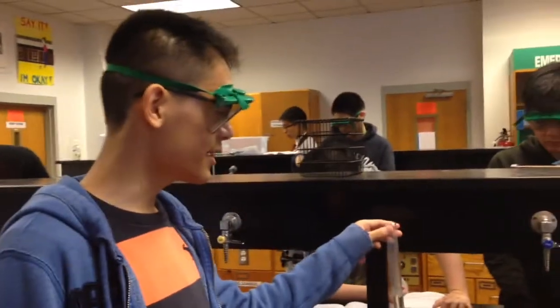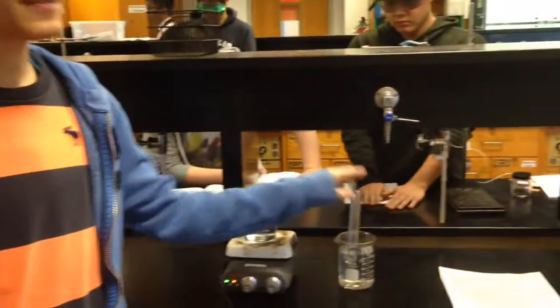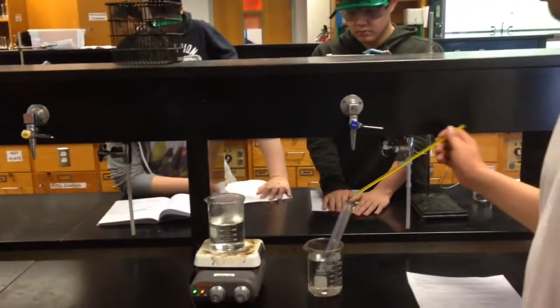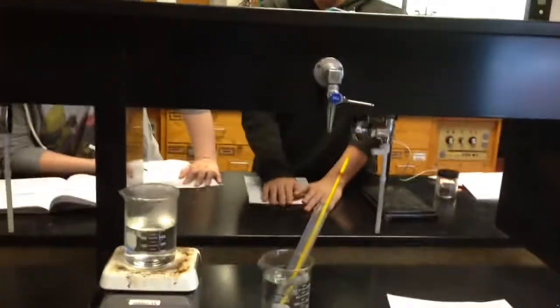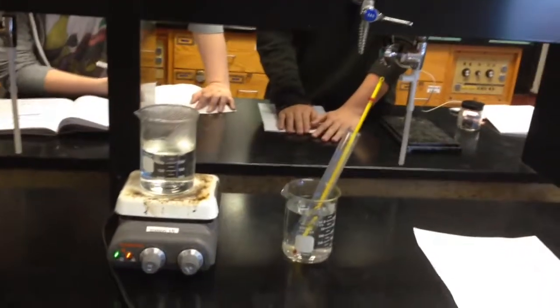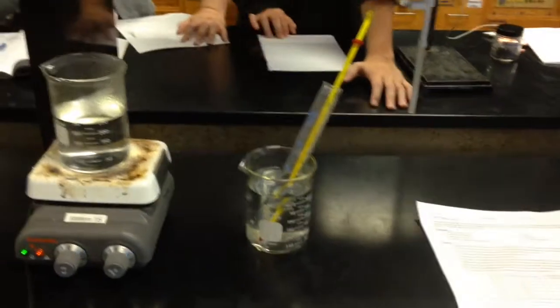When the KNO3 is dissolved, remove this from the hot water bath and place it into the cold water bath. And put in this thermometer to record the temperature. Eventually, crystals are going to form. You want to record the time it takes for the crystals to form, so you might as well use your phone as a timer. When the crystals form, note the time and the temperature.